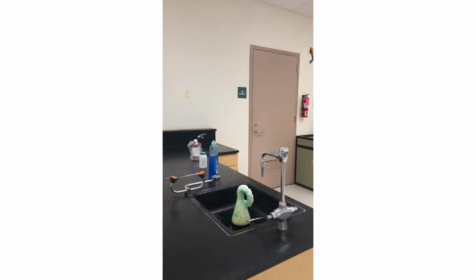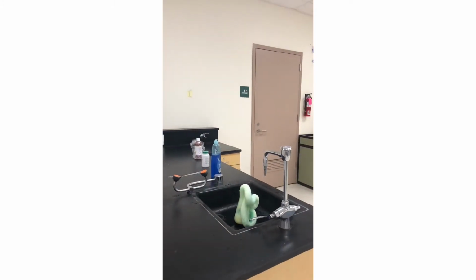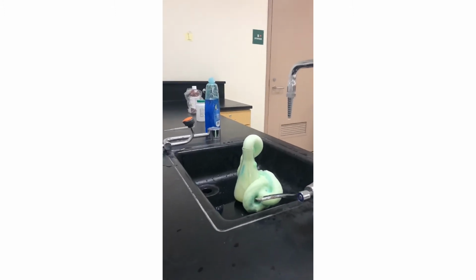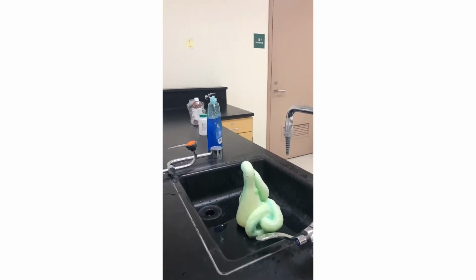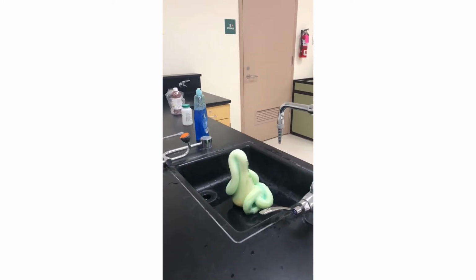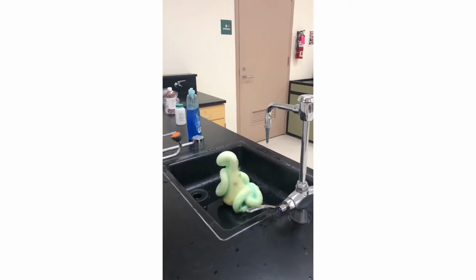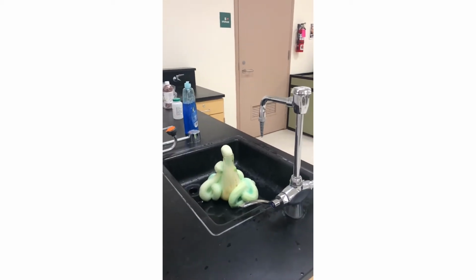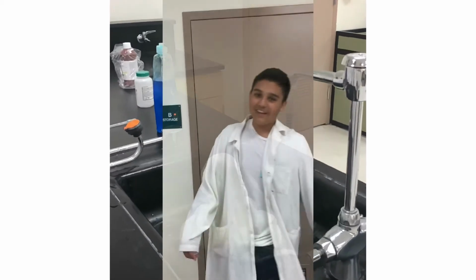See the heat coming up? That's better than it was last time. It's a lot faster. What are we doing now? And it's very hot. What are we doing this time? Exothermic reaction. Our fun activity. When you follow the rules, it's even better. You learn a ton in labs, but you learn even more when you're following the rules.